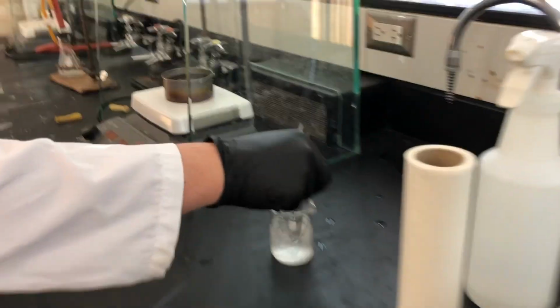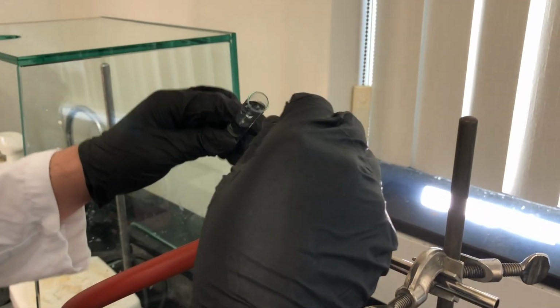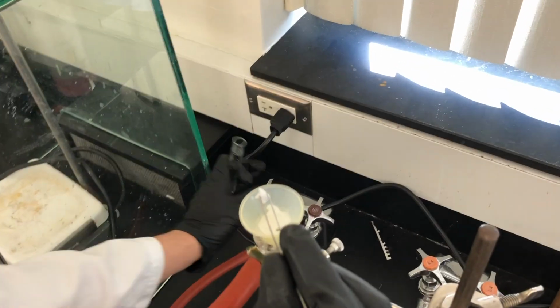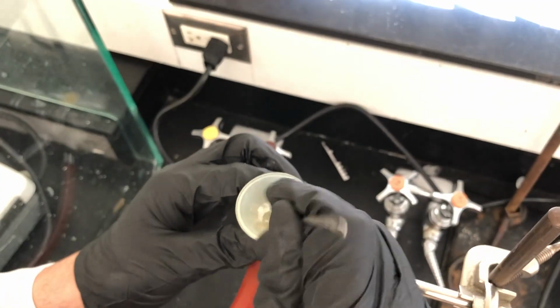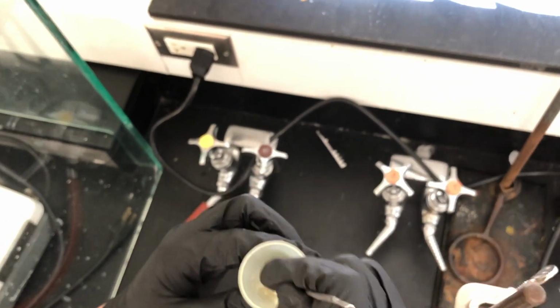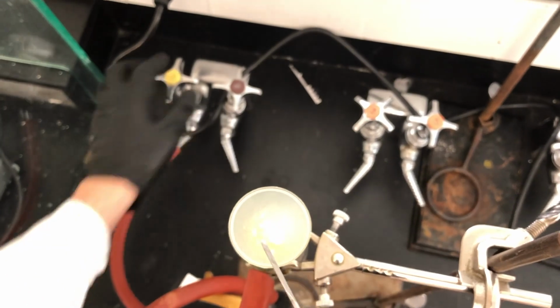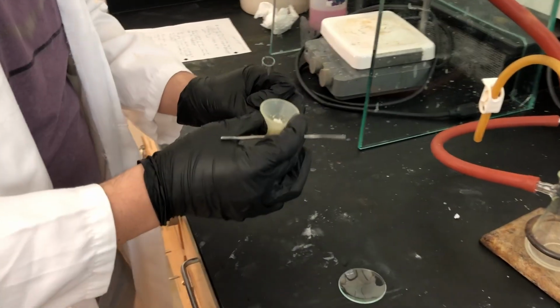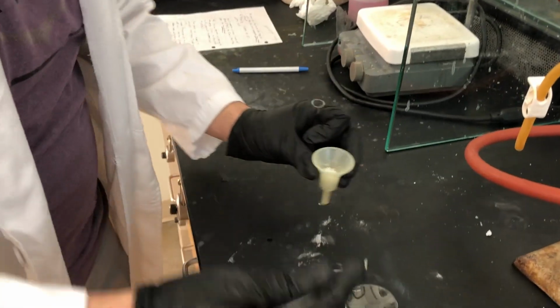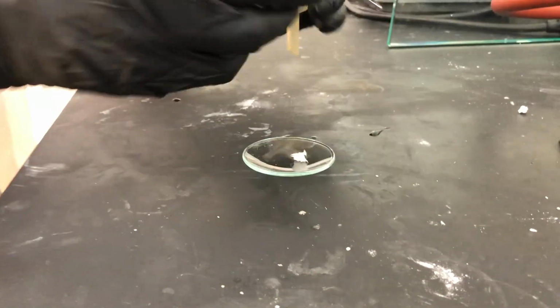We're actually going to rinse the filter with a little bit of ice cold water so that we can clean it out. I'm going to turn this on. Okay. Got some good product. Ooh, it looks like a little cloud. A little cotton ball. Okay, so we're going to put most of it into a small test tube so that I can recrystallize it. But we're going to keep a little bit on a watch glass so we can get the crude melting point.